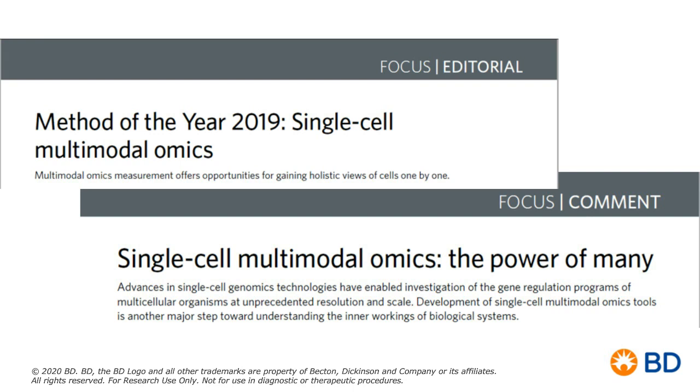No longer are we looking at what is the genome of a specific cell or maybe the mRNA transcript of those cells at one given moment, but instead we can answer questions like, what are the proteins that they're simultaneously expressing, or have they downregulated? How does that protein and mRNA correlate? And then what does that mean for our research or the patients or the disease that we're studying in their particular area of research?